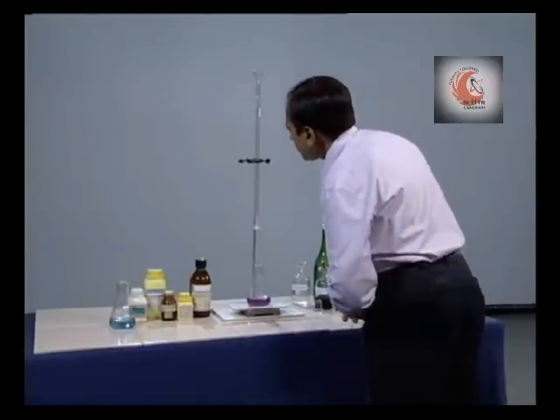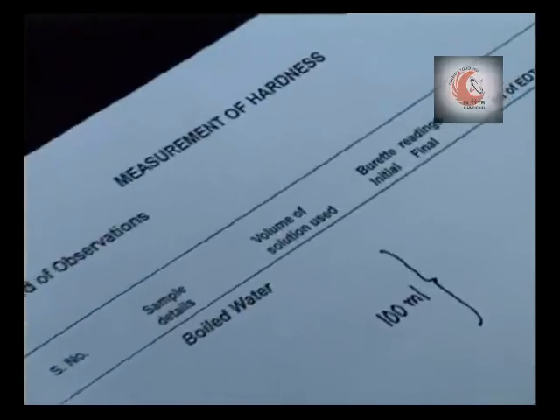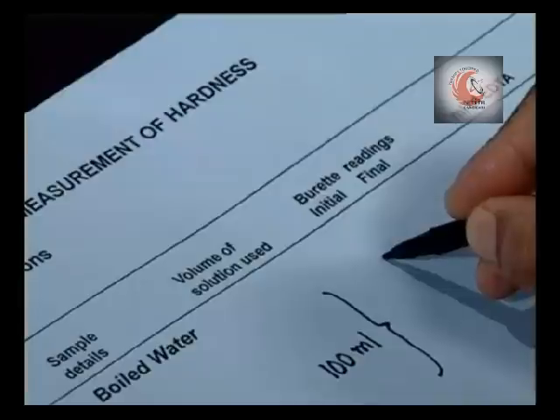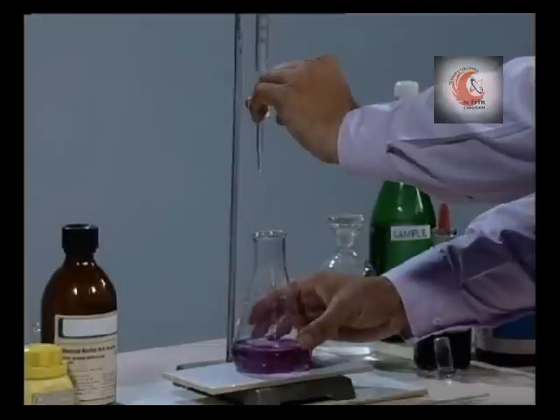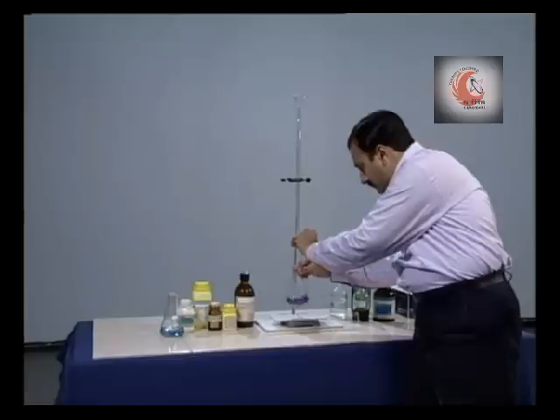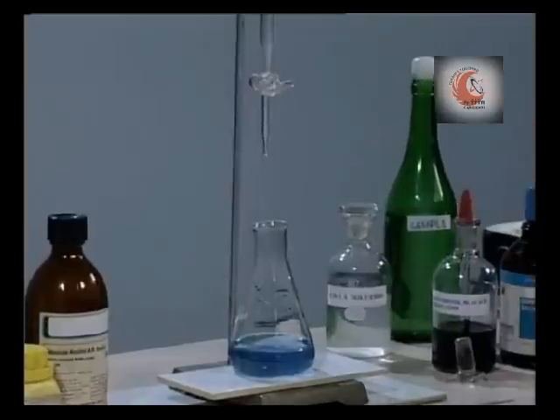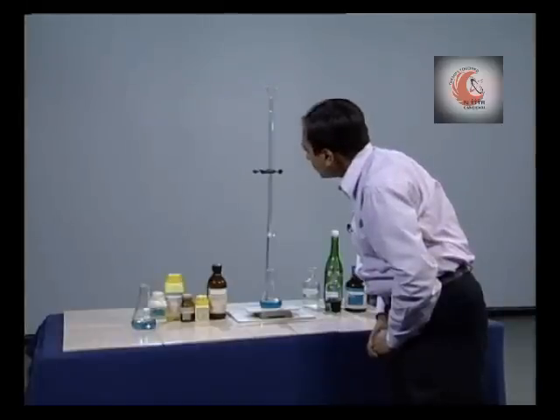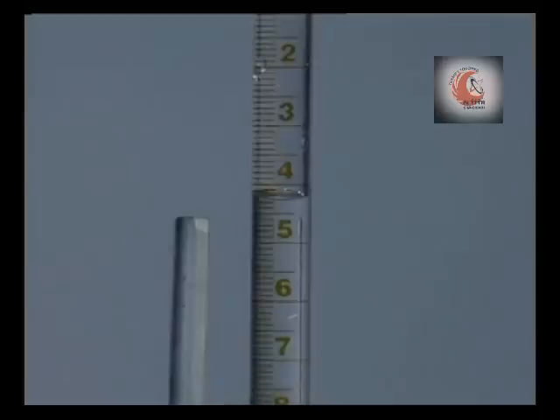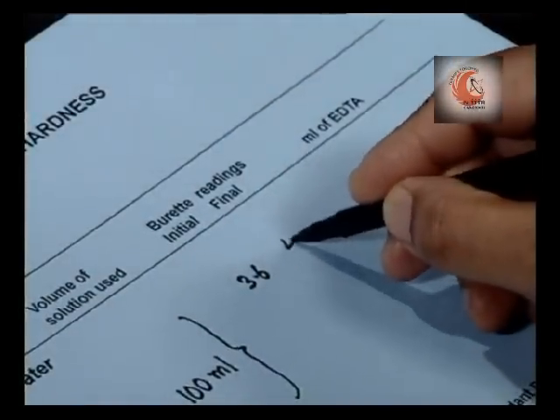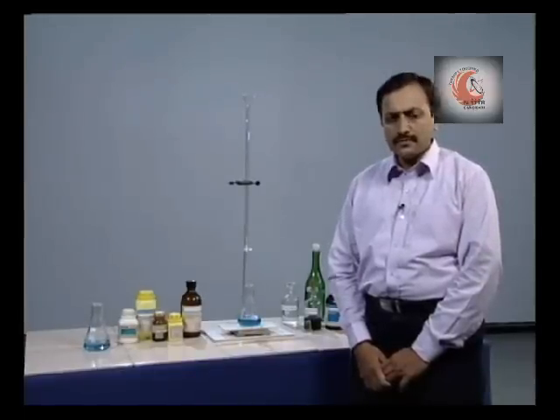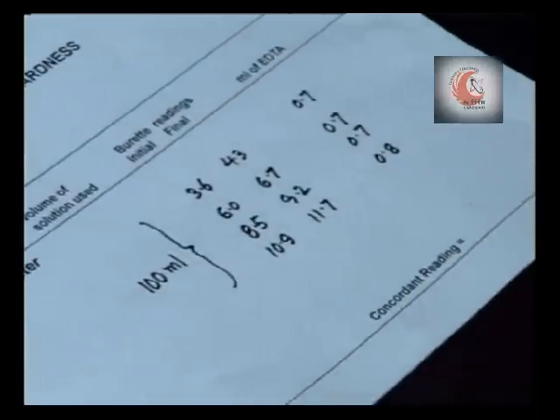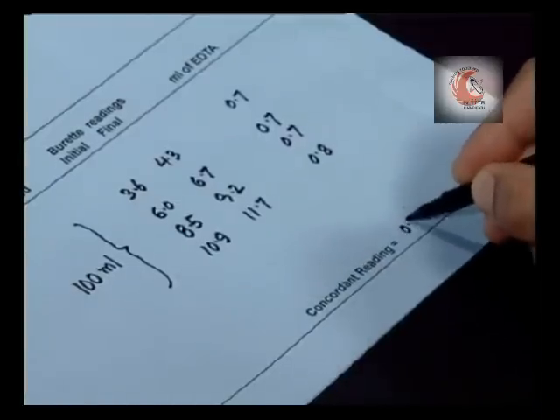Note down the initial reading. Titrate the sample till the blue colour appears. Note down the final reading and find the volume of EDTA used. Repeat the process till we get concordant values. The concordant reading is 0.7 ml.